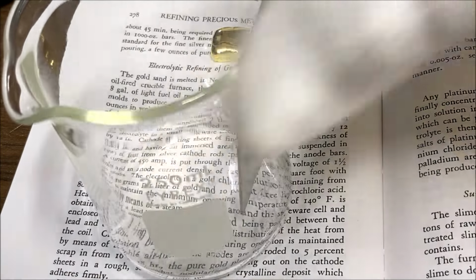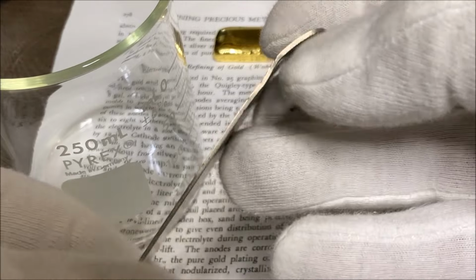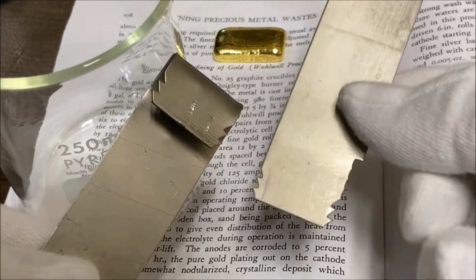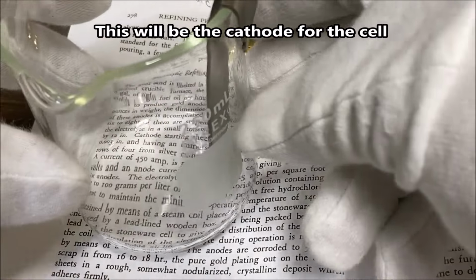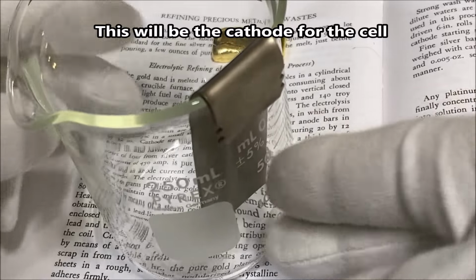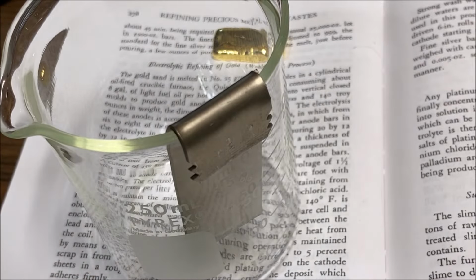What I have here is a titanium spacer out of a turbine. I bought 2 of them. And this is titanium, and I've just bent it so that it fits in my 250 milliliter beaker. And this is what we'll use for the electrolytic gold cell.